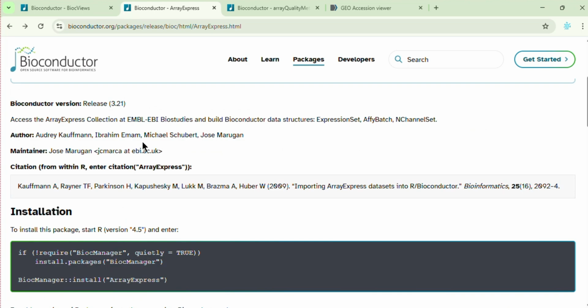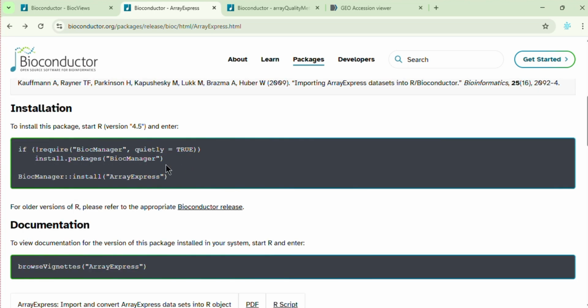To work with Bioconductor packages, the first thing you need to do is install BiocManager. As the name suggests, this allows you to manage the Bioconductor environment in R. It helps you install and manage Bioconductor packages. This actually comes from the CRAN repository, not from Bioconductor, so you can install it using the install.packages function, in the same way we install any CRAN package. After installing BiocManager, you can install any Bioconductor package using the BiocManager::install function, and in this process make sure the versions of the packages you are using are compatible with each other and with your version of R.